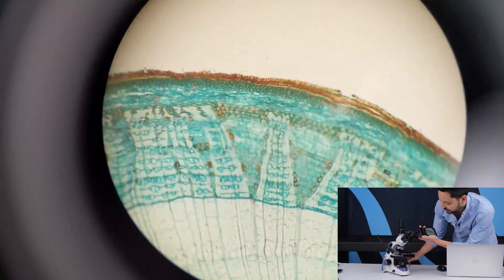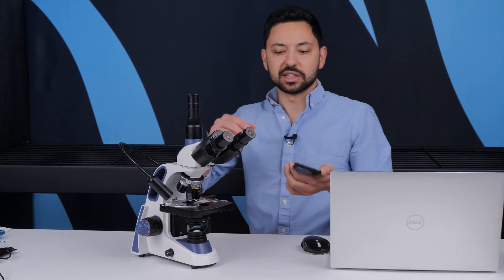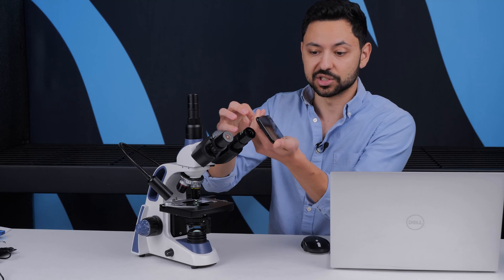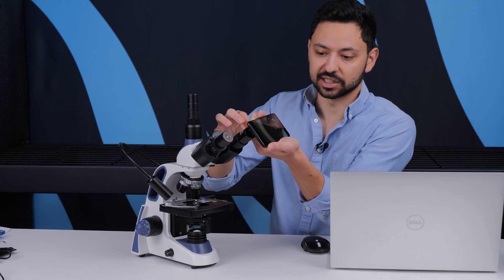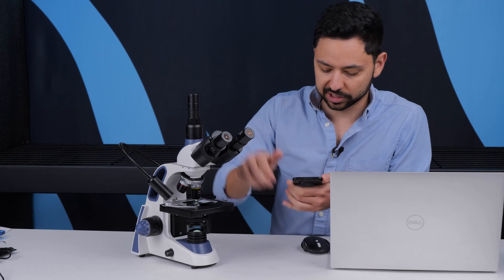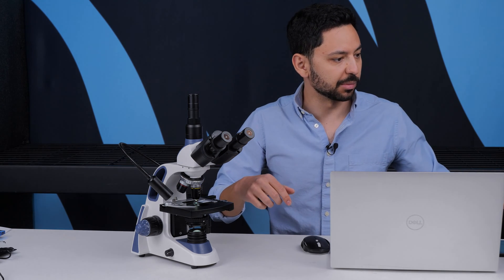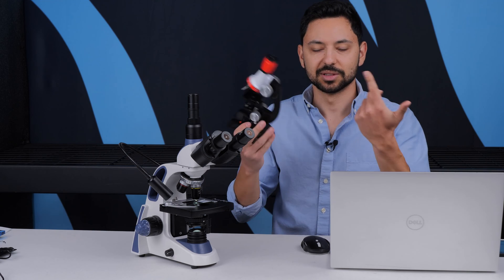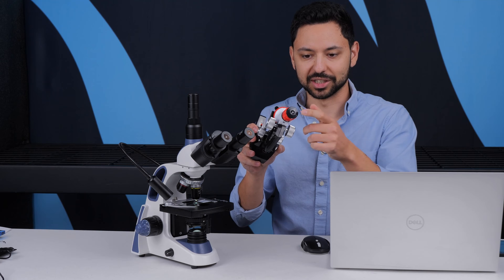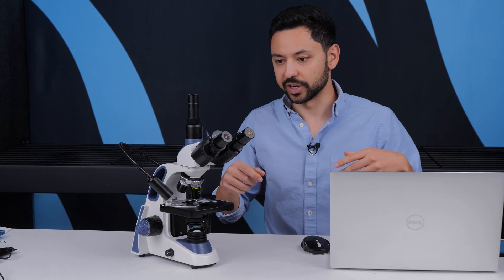With 25x eyepieces it gets way harder to do, because the optical alignment between the camera and the eyepiece has to be way more precise, so with any handshake it's going to go all over the place. But this doesn't look too bad — these are also relatively large diameter pupil eyepieces so it's not as much of a problem. On a $20 kids microscope the actual glass entry point is super tiny, so trying to center your phone over an even smaller piece is way harder.